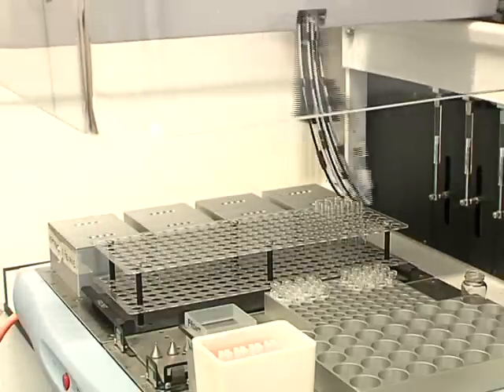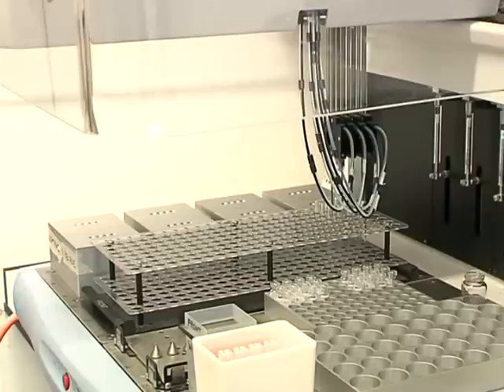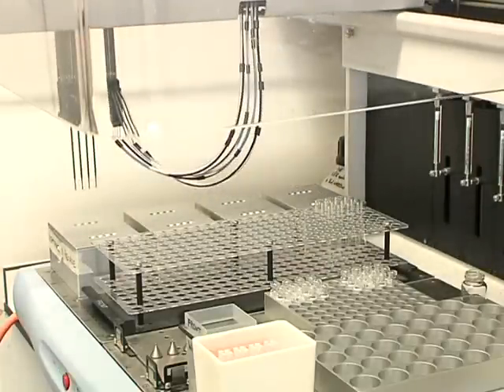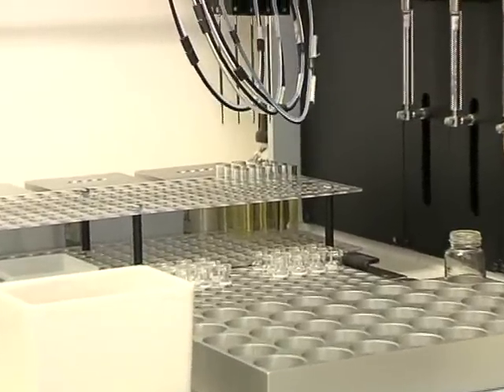The whole process takes several hours, depending primarily on the length of each analysis assay. But its automated nature means it can operate unattended, even overnight, and the operator need only look through the data to determine the best solvent system to use.